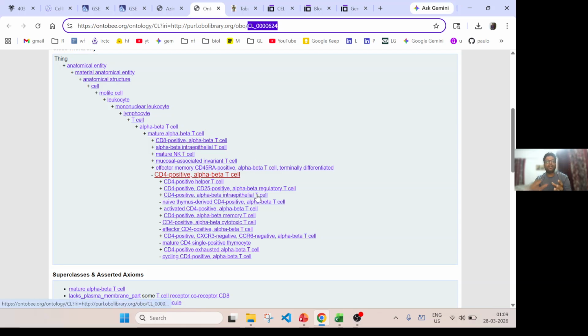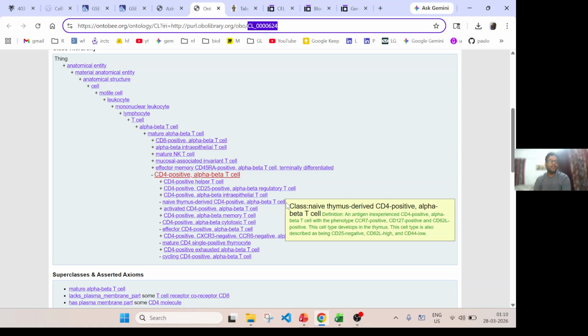This will be very helpful for normalization of the names, because the CellMarker database will give some different name, Azimuth may give you a different name, and the MSigDB database will give you another name. So if you come back here, this ontology will be helpful for us to annotate when we normalize. That's where nowadays AI is very helpful, because AI has an easy way to comprehensively understand this language. They are superior in annotating because it's not a keyword-based match. They understand the name easily, and combining all these methods will be useful.